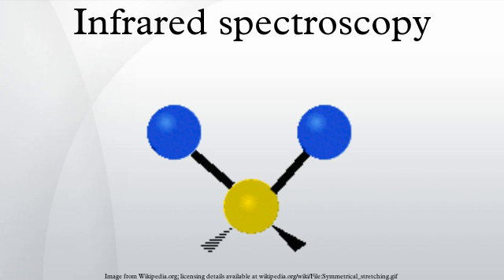The sample, liquid or solid, is placed into the sample cup, which is inserted into the photoacoustic cell, which is then sealed for the measurement. The sample may be one solid piece, powder or basically in any form for the measurement. For example, a piece of rock can be inserted into the sample cup and the spectrum measured from it. It is important to note that spectra obtained from different sample preparation methods will look slightly different from each other due to differences in the sample's physical states.